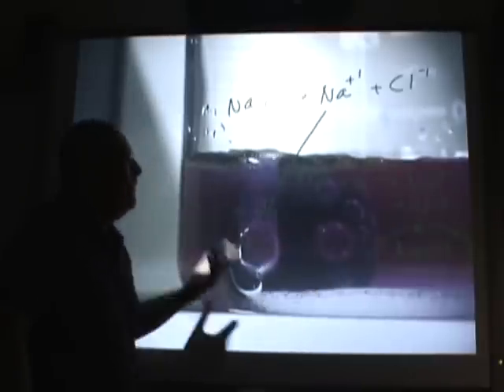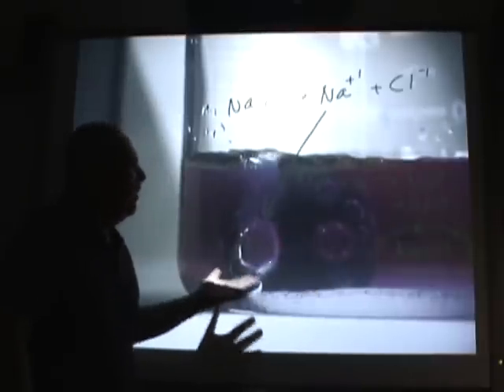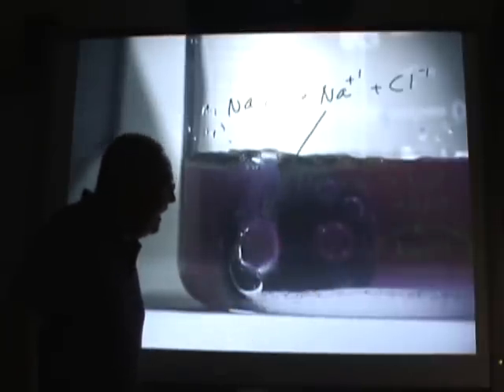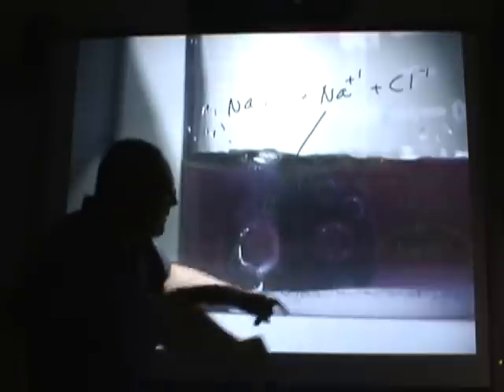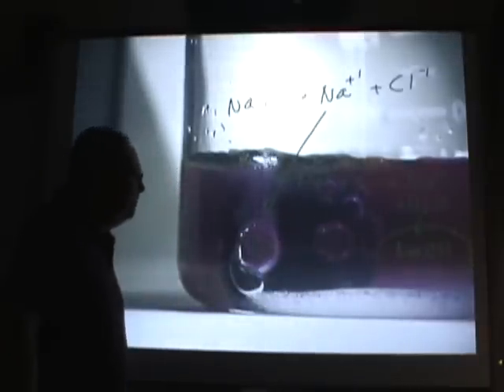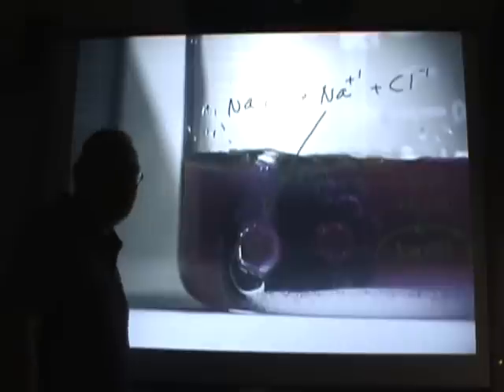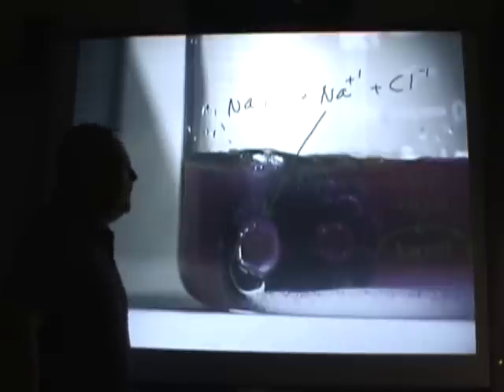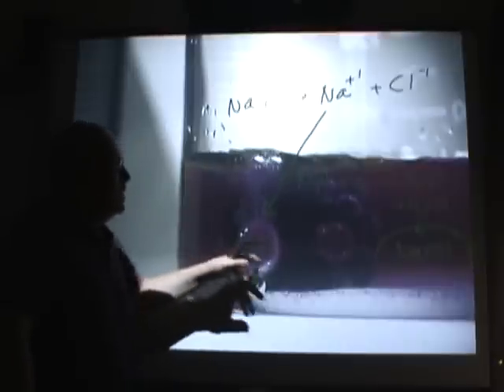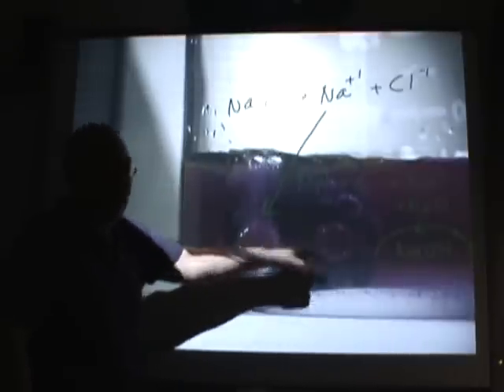So what are we forming over here? Well, apparently not a whole heck of a lot. We are getting some bubbling going on here. But it doesn't appear to be coming much from the terminal. Let's see if we can figure out what's going on here. Well, if the sodium is attracted here, then guess what's attracted here? You got it. The chlorine.